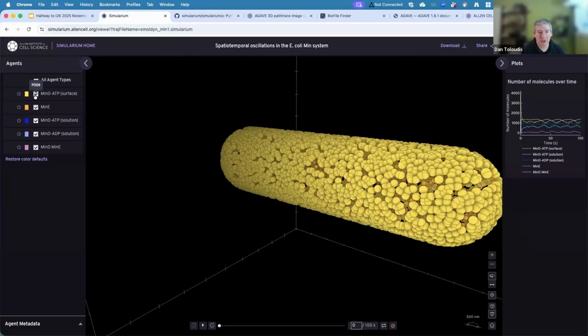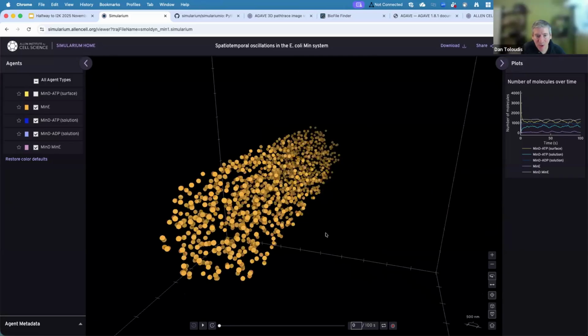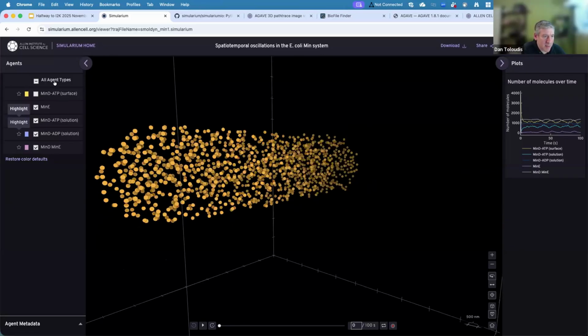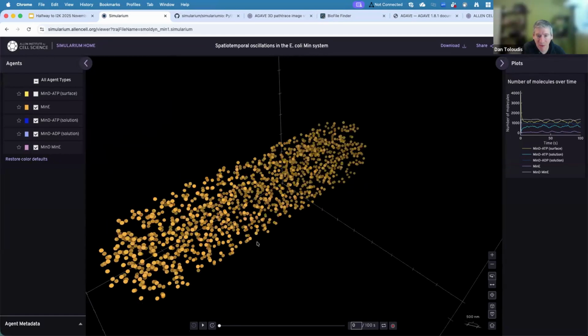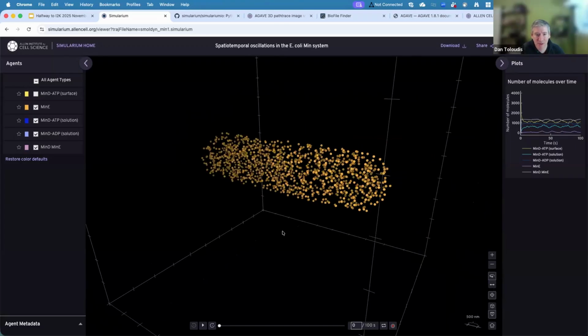And in fact, there are more than just the yellow ones in here. There are these amber colored ones. And apparently, according to my map here, there are 3 other types that I'm not actually seeing right now, which indicates to me that they probably are going to show up later on in the time sequence.